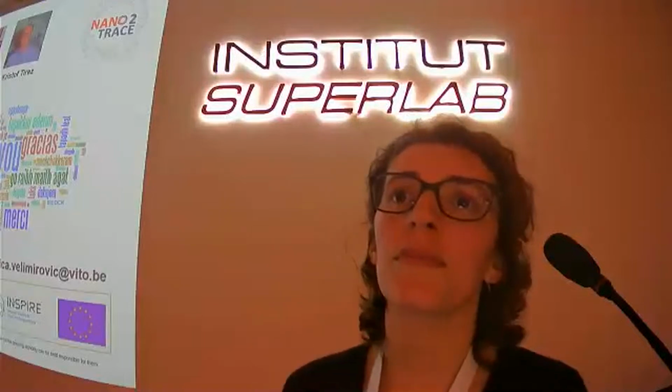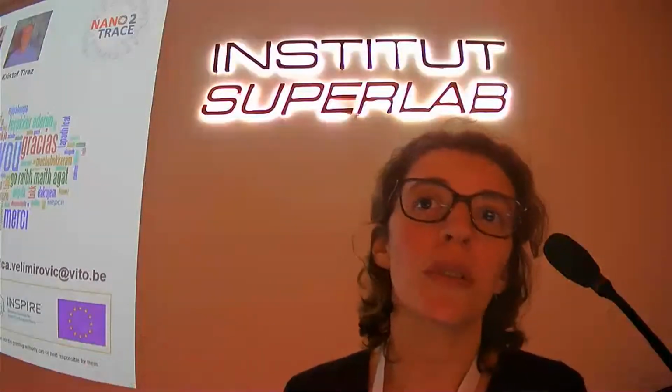And for the second question, you mentioned that you have also tried to couple techniques for fractionation, and you find it challenging in different fields, but you can also use centrifugation, gradient centrifugation, and DLS to characterize the particles, for example. I mean, there are just too many techniques, so we concentrate on certain ones where we are sure that they have potential to analyze.